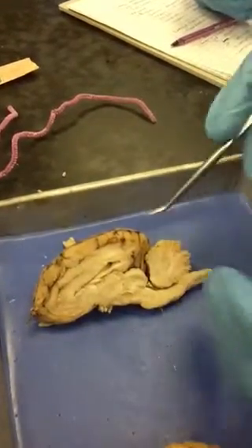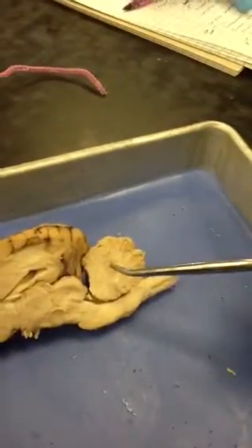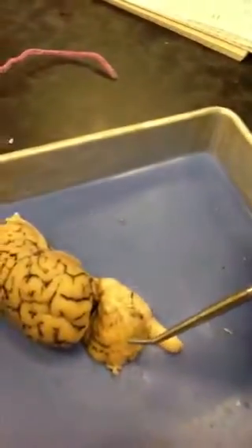Okay, let's go to the cerebellum now. The inside white matter is called the arbor vitae, and then the outside, the gray matter, is the folia. These are the folds.